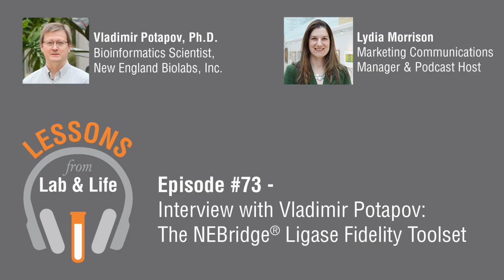And so you've mentioned a couple of tools in the NEBridge Ligase Fidelity Toolset. Are there any other tools that are available within there?